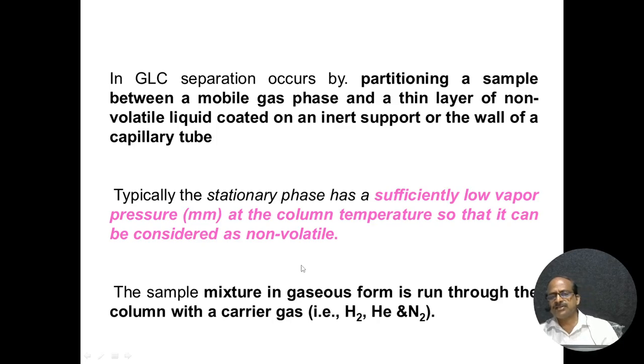In gas chromatography, the sample mixture gases run through the column with the carrier gas, which carries them from one place to another.